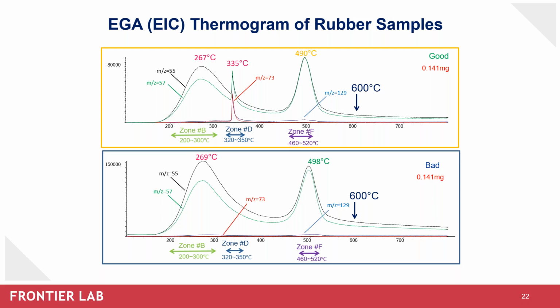Fantastic. Looks like we have another question here for you, Athena. When a sample cup is dropped into the pyrolysis furnace, what stops the sample from spilling from the sample cup?